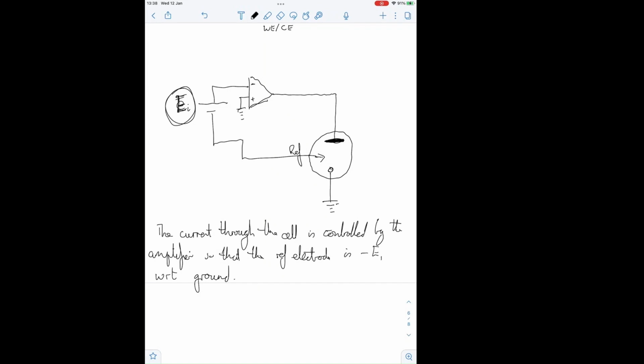So what are the implications of that for doing good measurement or using a potentiostat? We talked about the reference electrode. The first implication here is that we're going to drive current. We're going to drive this counter electrode to have a certain current.